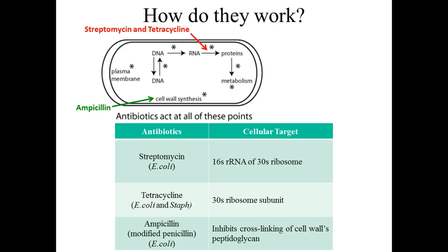And we're going to use this antibiotic later in our transformation experiment towards the end of the semester, where we're going to make E. coli ampicillin resistant, right? So it will actually grow in the presence of ampicillin. But we already know right now, natural good old E. coli, non-transformed, is killed by ampicillin. We've seen that in our experiment that we set up.